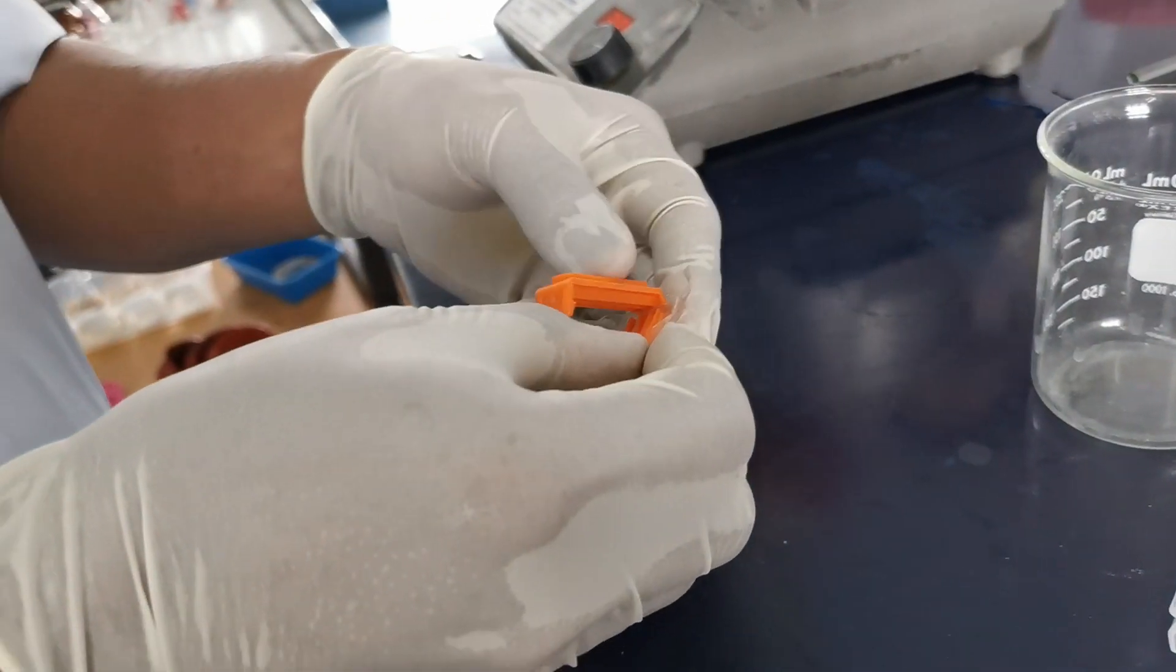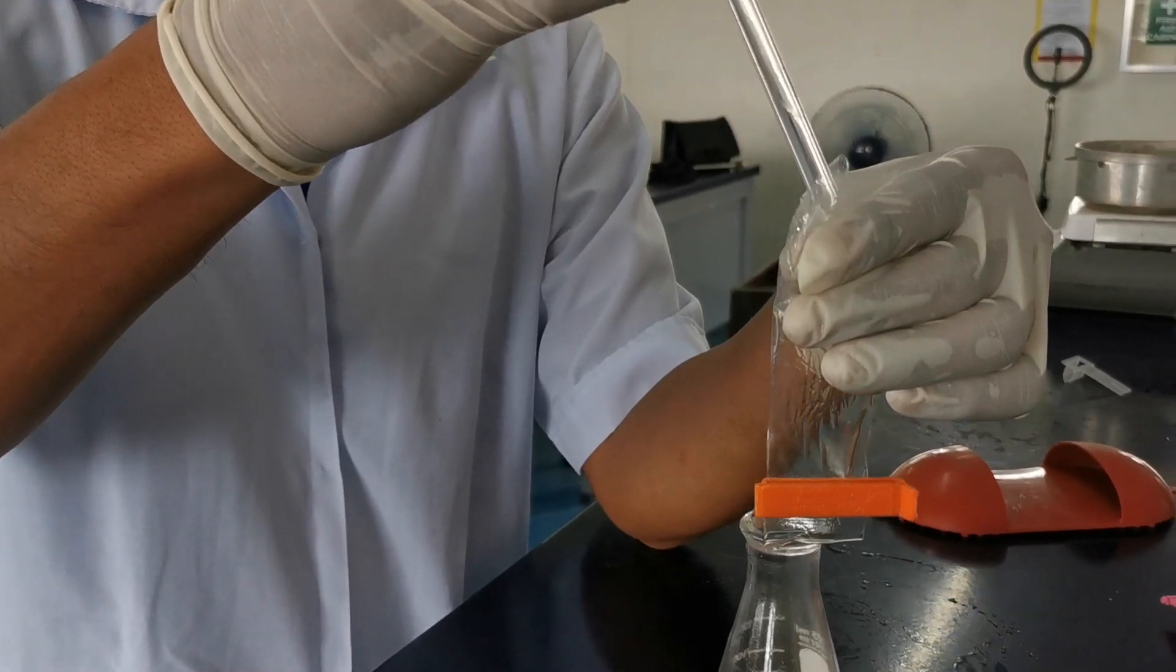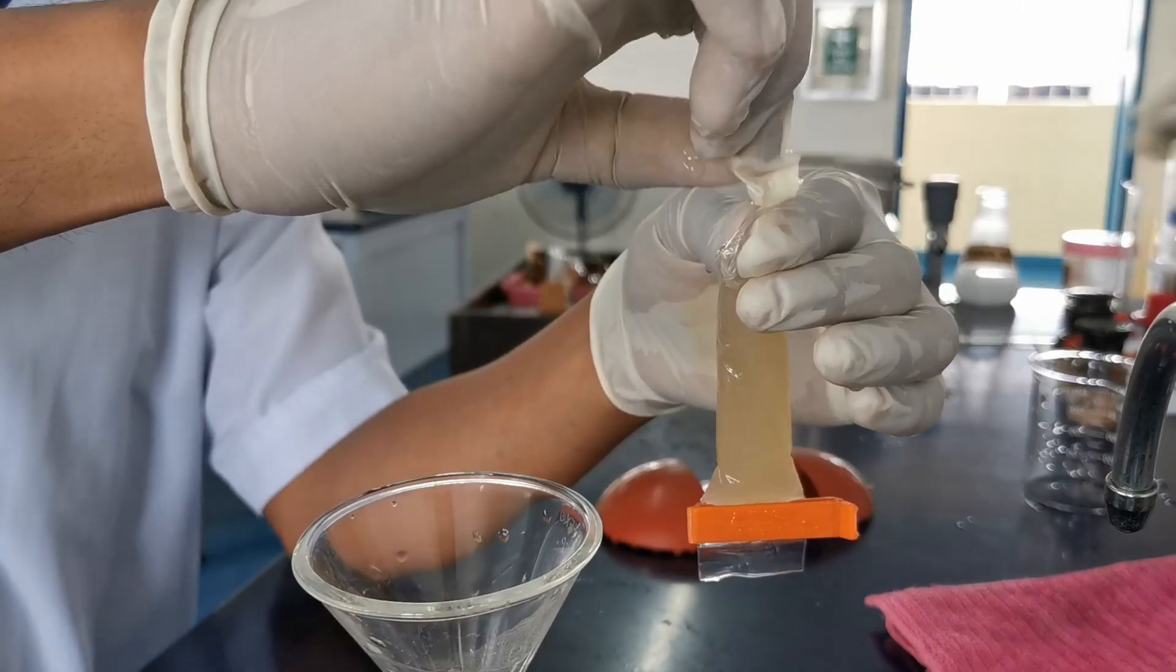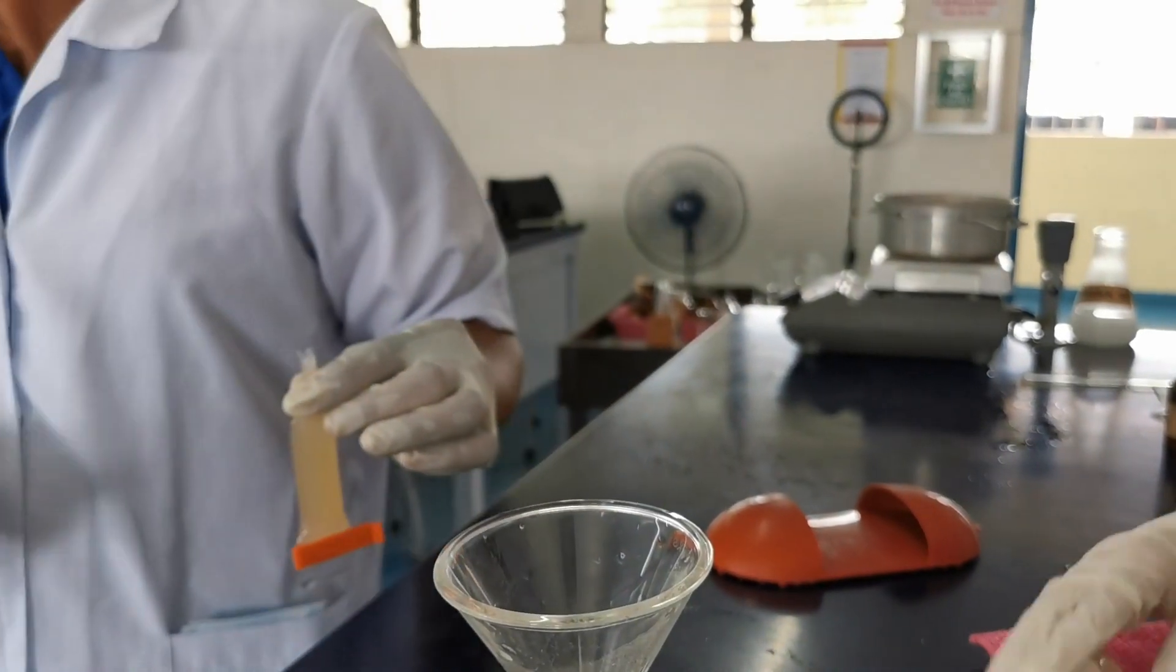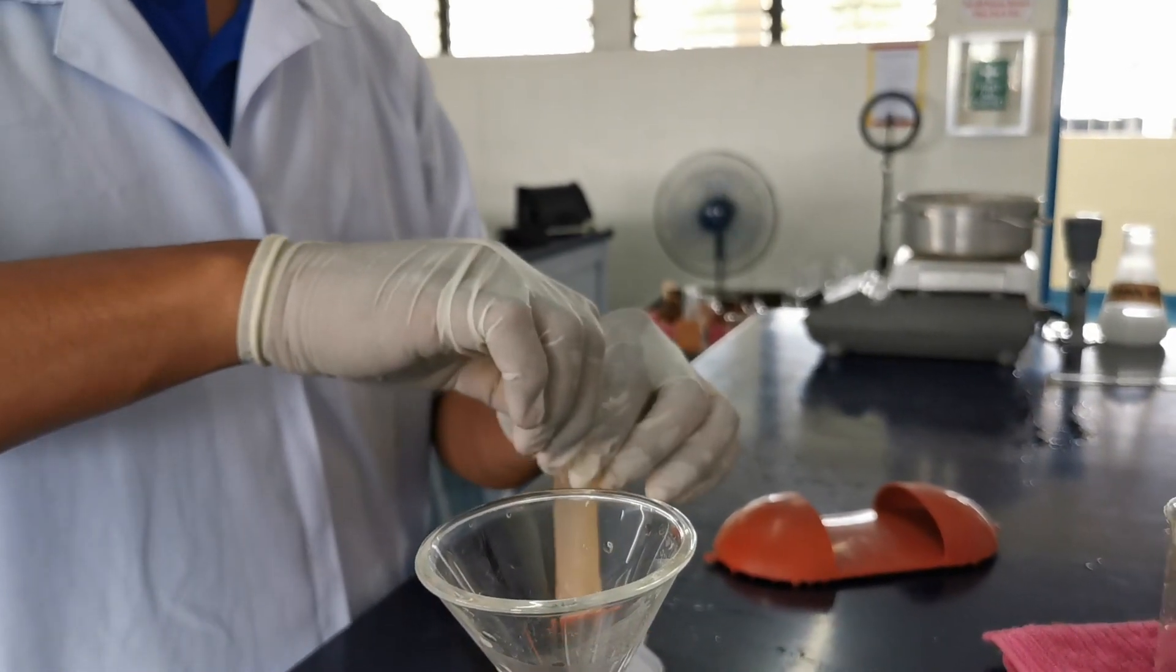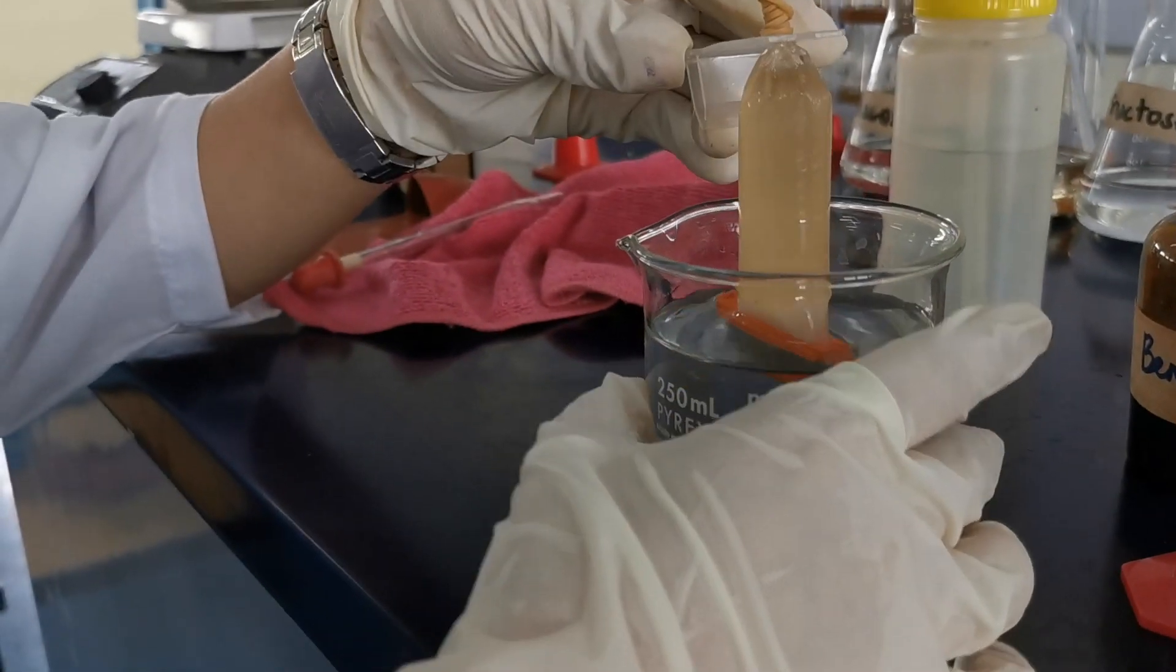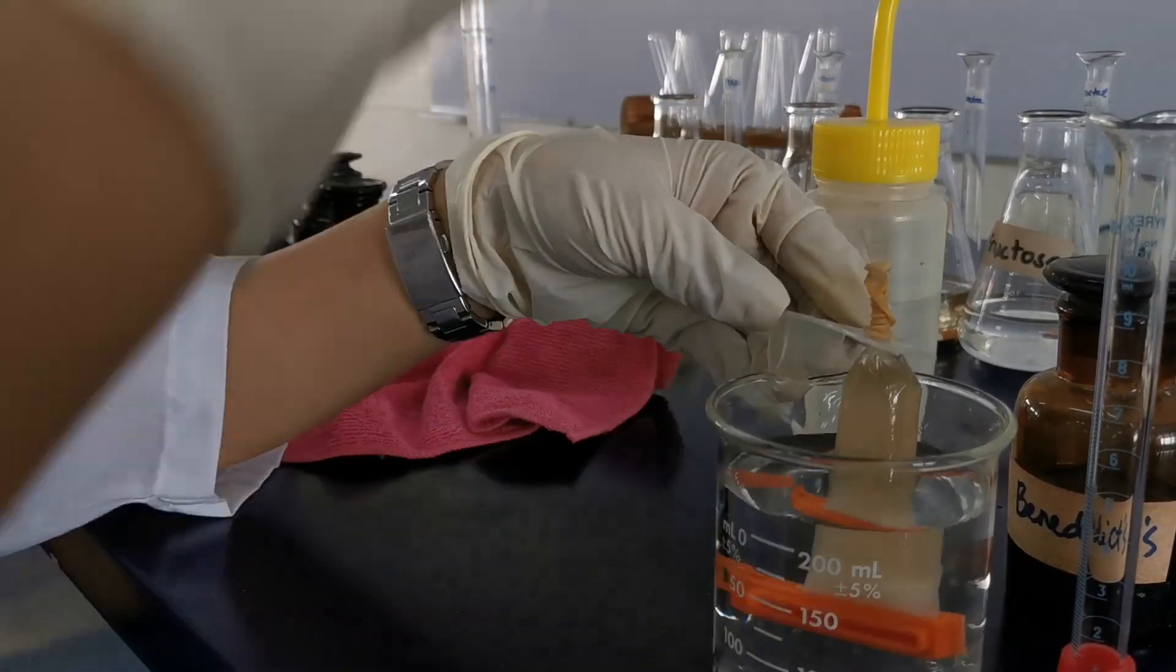Next, pour some of the starch, salt, sugar solution into the dialysis bag. Tie each ends using a clip. Suspend the setup in a beaker filled with distilled water, let it stand for 15 to 30 minutes. Afterwards, we test the water in the beaker for starch and sodium chloride following the same procedures during the filtration test.